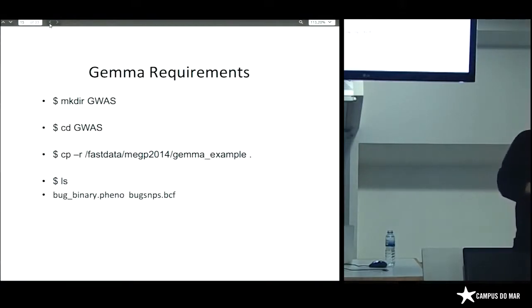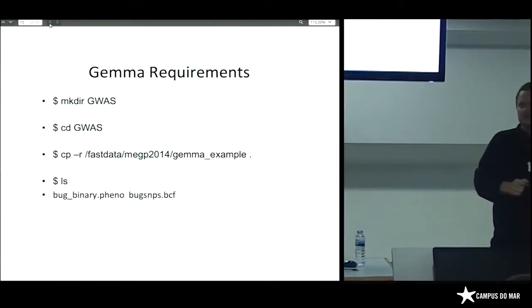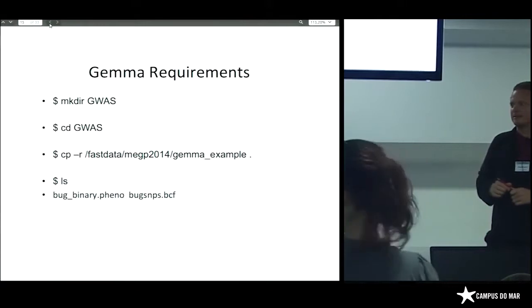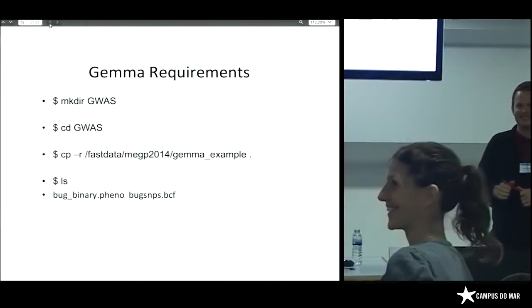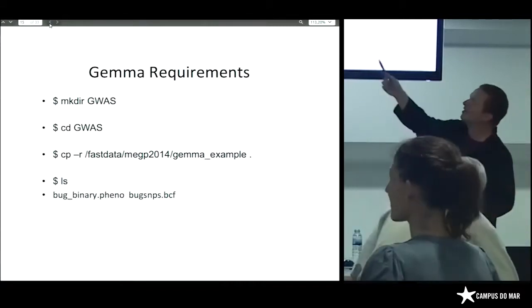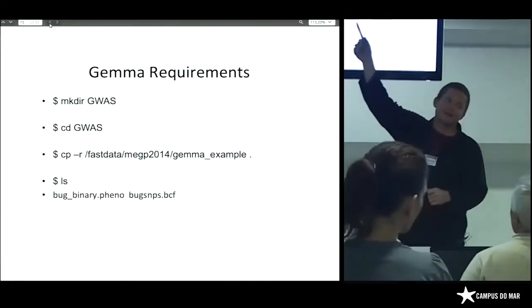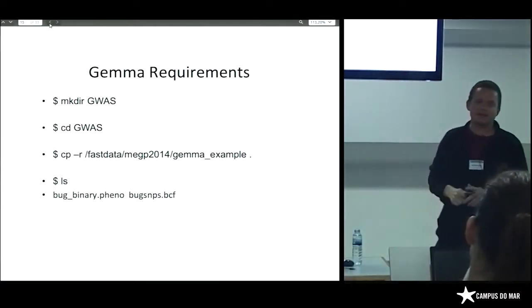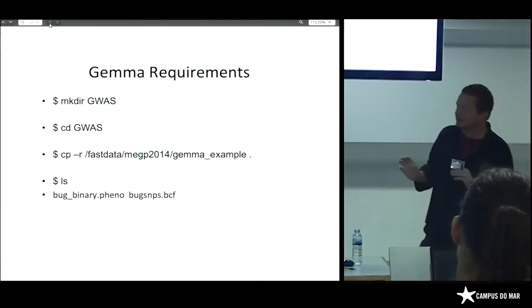Does anybody not have those 2 files? Put your hand up if you have no idea what I'm talking about. Okay, so everybody has those 2 files, and they're in the same folder. And that folder, you can call it whatever you want. If you've called it GEMMA example, it's going to be a lot easier. If you have those 2 files, we're ready to go.